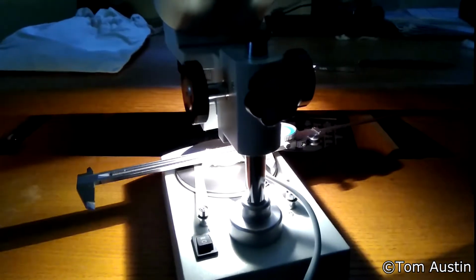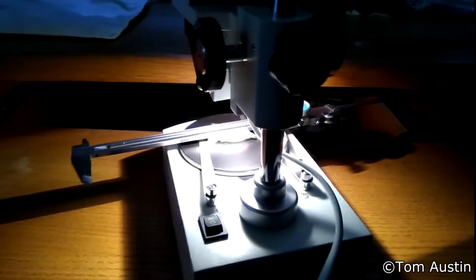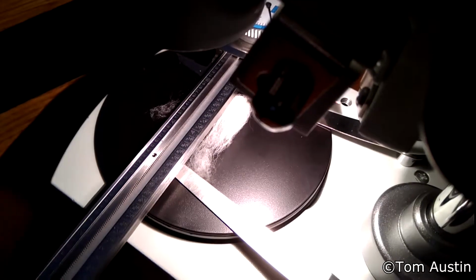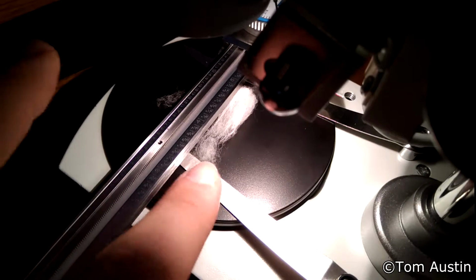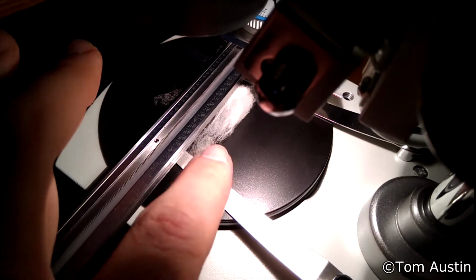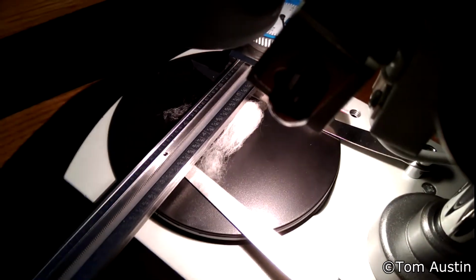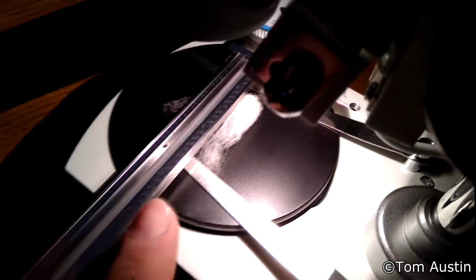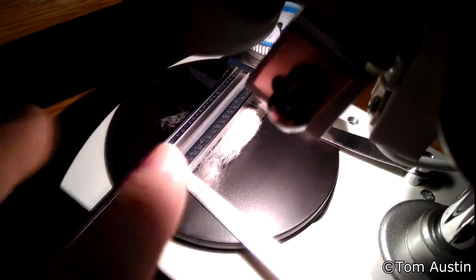So I'm going to try and let you take a look through this dissecting scope and inspect the lint more close up. I don't know how well you can make it out down there, but it is right about 1.5. So it's bunched up right now at the moment. What you see here, this is separated. You see that dark gap right there to here. That's where the lint has broken or pulled off of the seed and it's coming out. It's trying to form a sliver. And it's all sort of fluffed up at the moment.